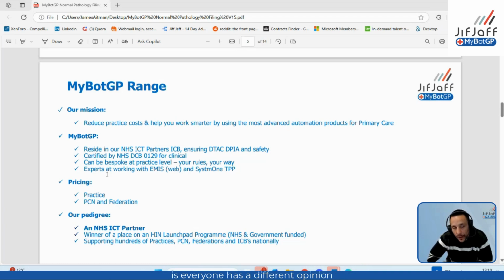And the reason we do that is everyone has a different opinion. Labs have different ranges. They use different keywords. One doctor might want to evaluate something in one way and another in a different way. So you're able to do that through our platform.